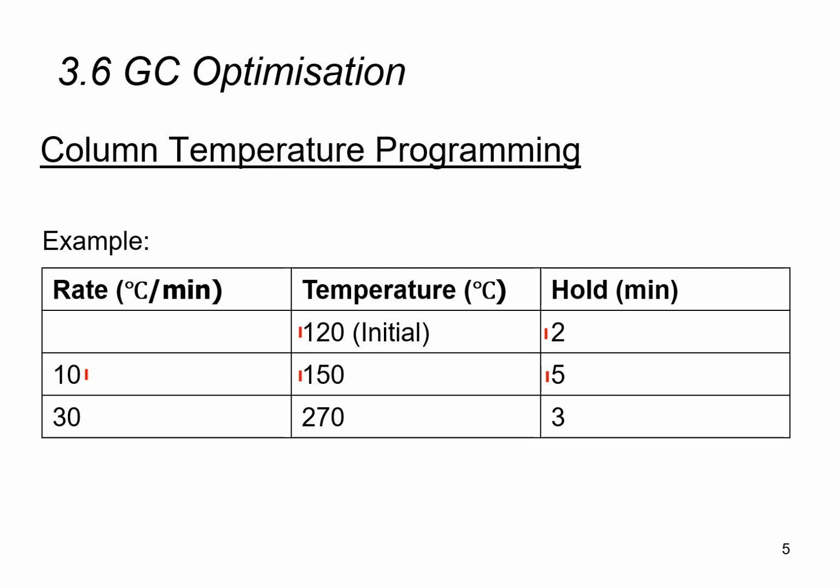separated. And then now that we are much later in the analysis, we can quickly raise the temperature 30 degrees per minute to quite a high temperature, so 270 degrees C. And at this high temperature, the very highly retained compounds will be essentially chased out of the column, right? So this ensures that the overall analysis time does not take too long. So the very highly retained compounds do not stay for too long in the column.